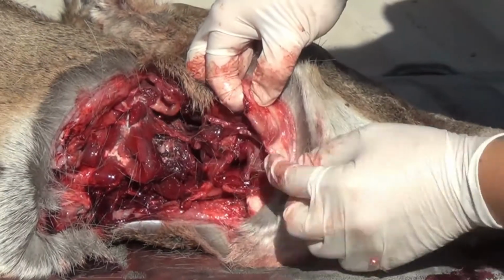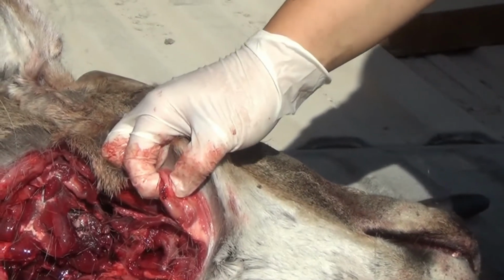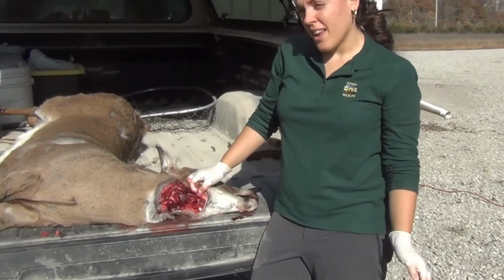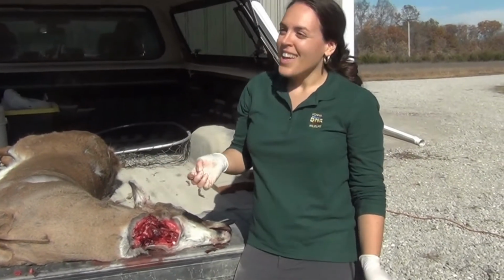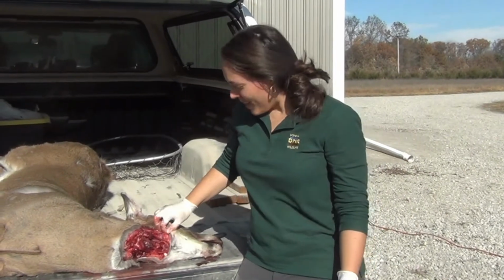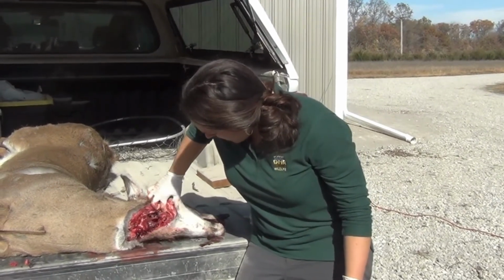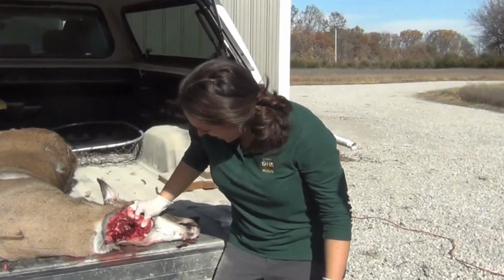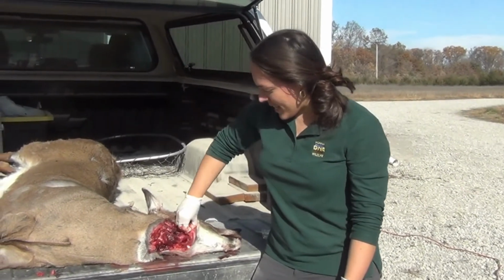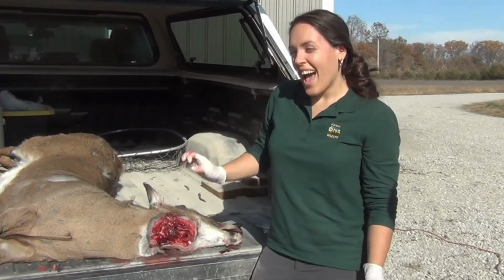Might be hard to appreciate, but this is another lymph node, and it has a little blueberry right in that same location. So that's a really good indicator that you're in the right spot, that you have a lymph node, first of all, and that you're in the right lymph node, second of all. It looks like this deer might just have small lymph nodes that got mixed up when it got hit. But this is the exact tissue that we're looking for. So that medial retropharyngeal lymph node has those little blueberries.